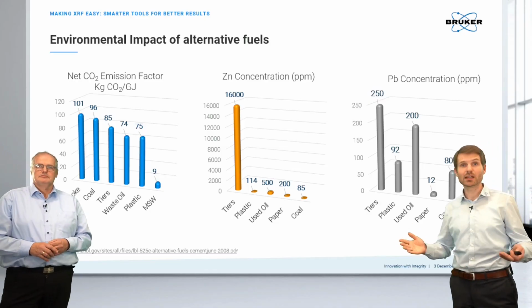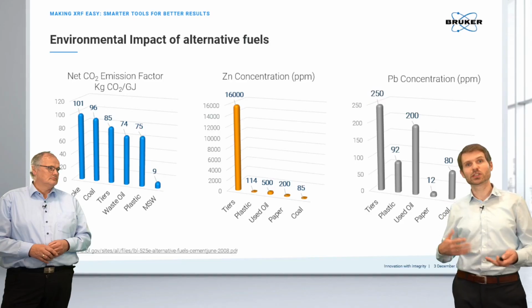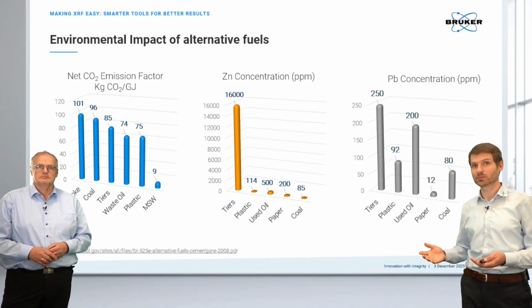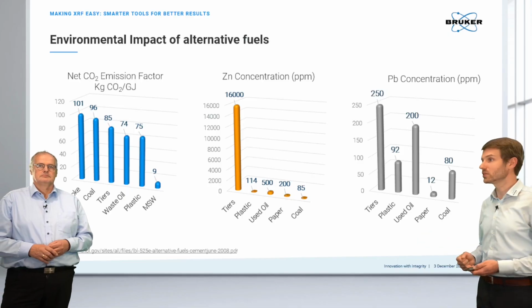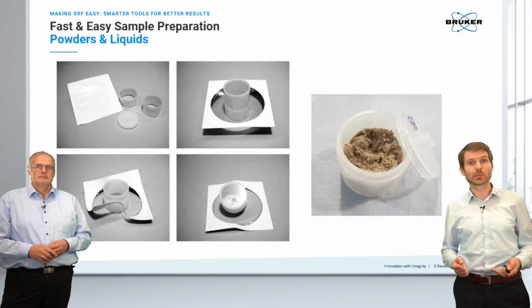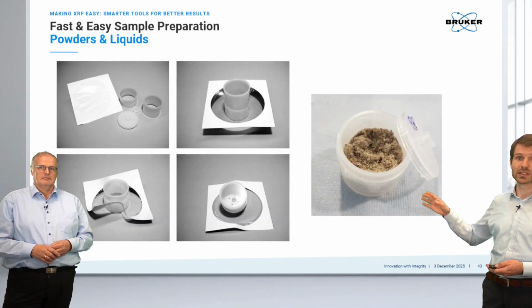Here, how to measure this depends a bit on which kind of solution in XRF, on your analytical requirements and precisions. Of course, some good, decent results can also be done with SMART-QUANT, but your better option is actually SPECTRA.ELMENTS. I will show you in a few minutes.